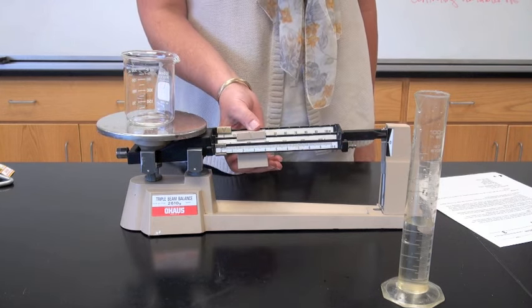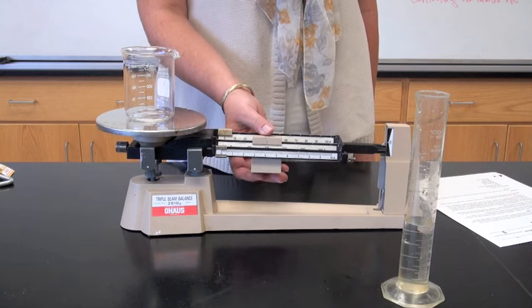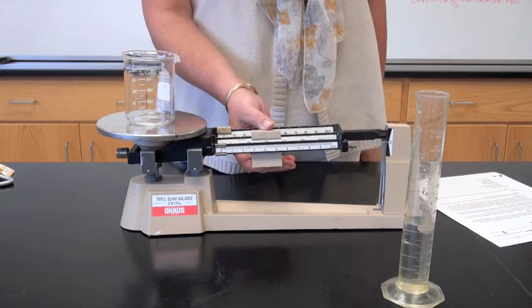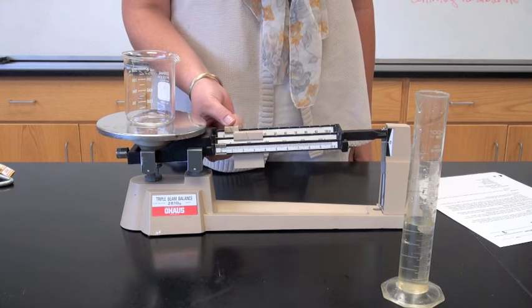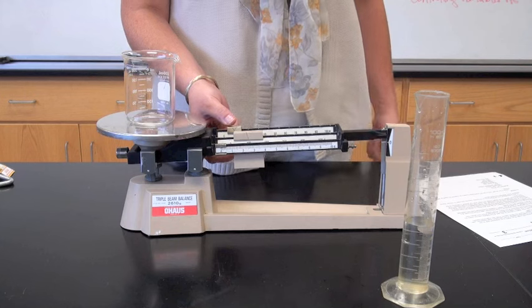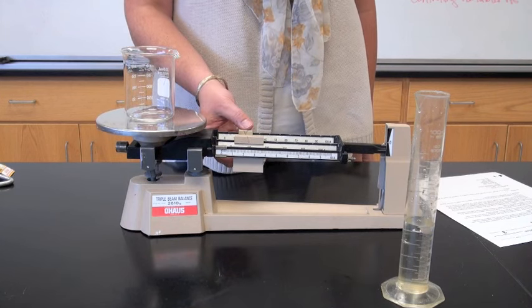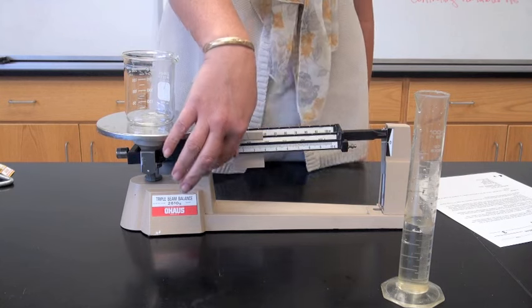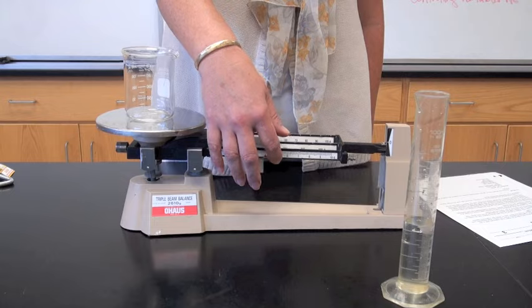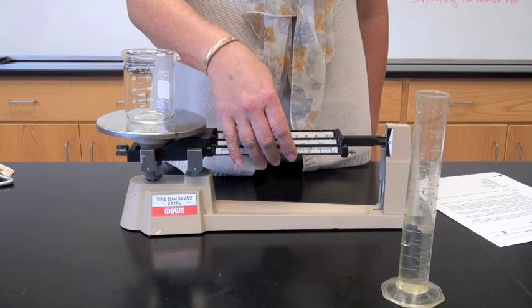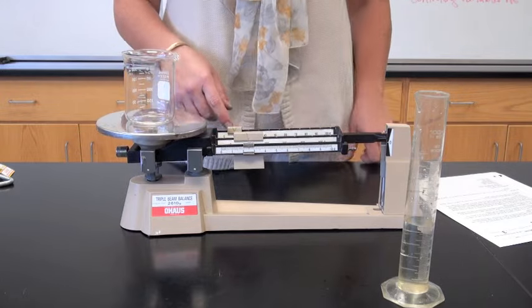move the largest rider first, make sure it's resting on a notch, then keep going. It's resting on the notch at 200, but it dropped, so that's too much, slide it back one notch. Now use the ten grams, one at a time. Still hasn't dropped, so now go to the next notch, and it drops, so that's too much, send it back one. Now you use the smallest rider until it zeroes out, and that's the mass of your beaker.